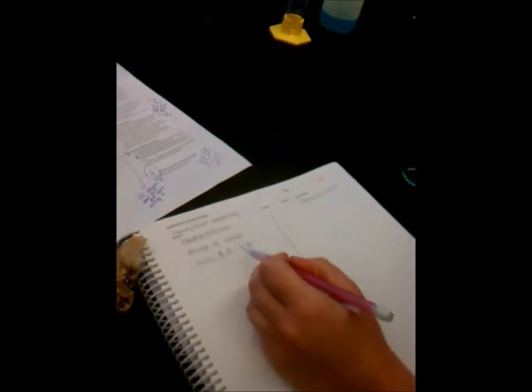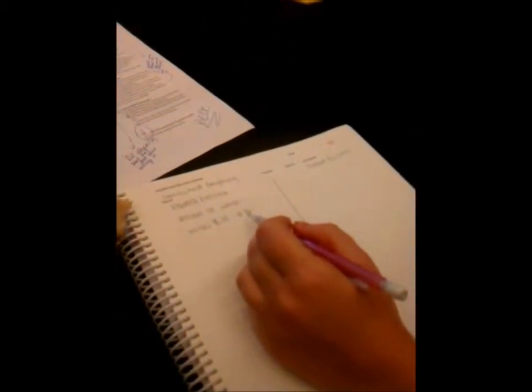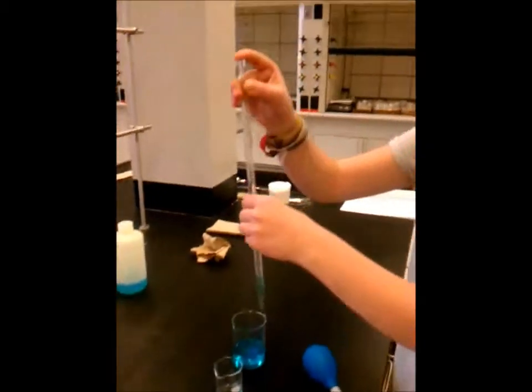And in order to find the volume in the beaker, you subtract the initial volume from the final volume. So that would be actually 938. That is how you properly use a pipette.